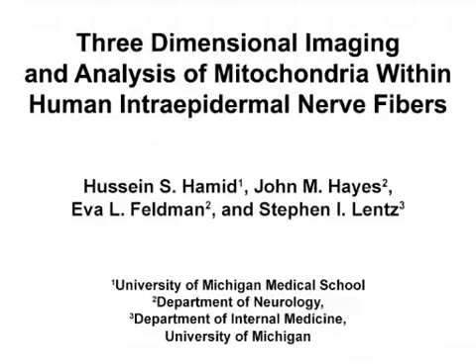The overall goal of this imaging and analysis technique is to isolate specific information from a complex signal. Specifically, this protocol describes how to visualize and quantify nerve-specific mitochondria away from other mitochondria within the epidermis. This method can help answer key questions in the field of neurology, such as how does mitochondria within intraepidermal nerve fibers of healthy individuals compare to nerve-specific mitochondria of patients with neurological complications?